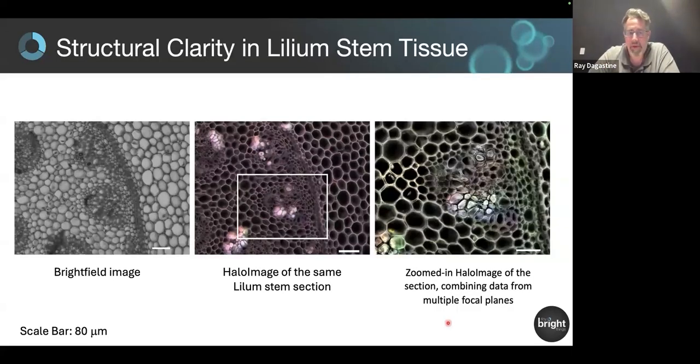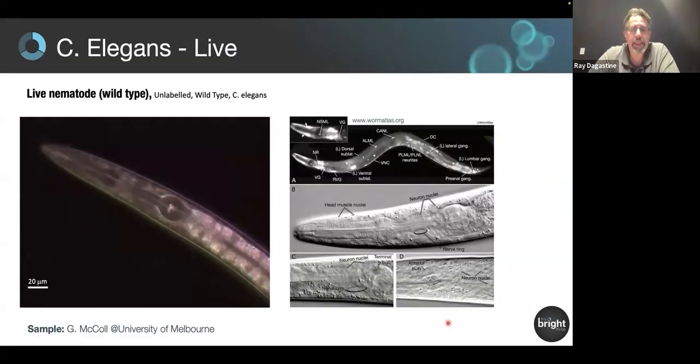The next example has really got me wondering. So this is a live C. elegans worm, and this is a juvenile, which is why we're still able to see it at, I think, a 20x objective. I mean, in the next frame, it actually moved its head, which kind of, well, it surprised the engineers. The biologists went, well, that's a good sign.